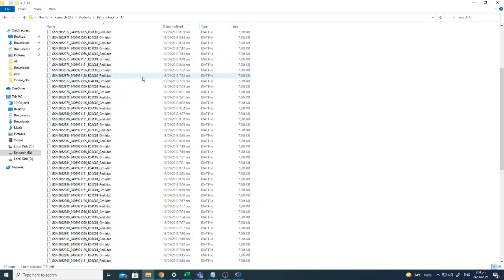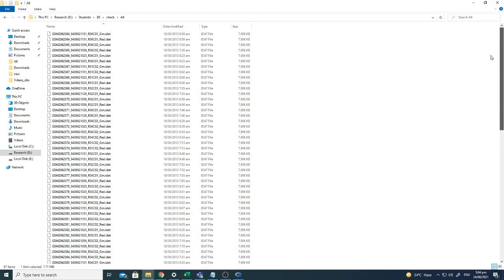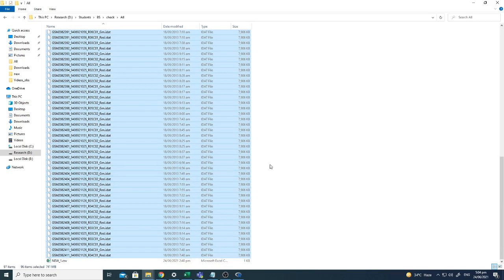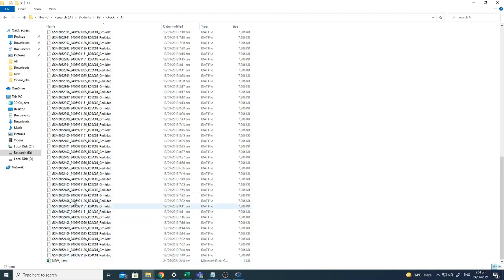And the other thing which ChAMP requires is one input file. You have to make a CSV format file. Total number of files is 96, and so the total number of samples will be 48, right? So depending on what type of analysis you want to do, you can make an input file.